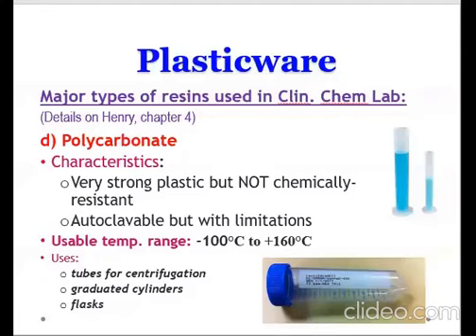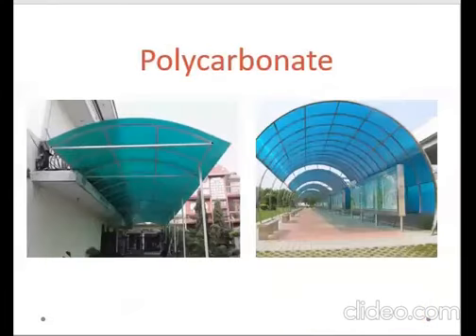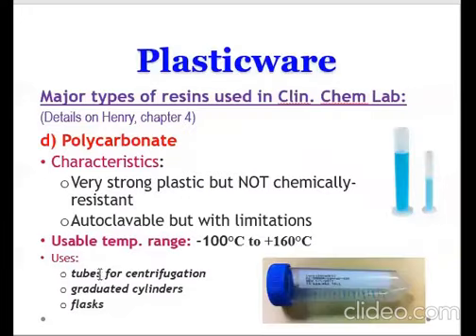Si polypropylene, pwede siya i-autoclave. Si polycarbonate, autoclavable but with limitations. So, I'd just like to clarify that one. Then for polycarbonate, aside from seeing polycarbonate in these things, you can also actually see polycarbonate here.